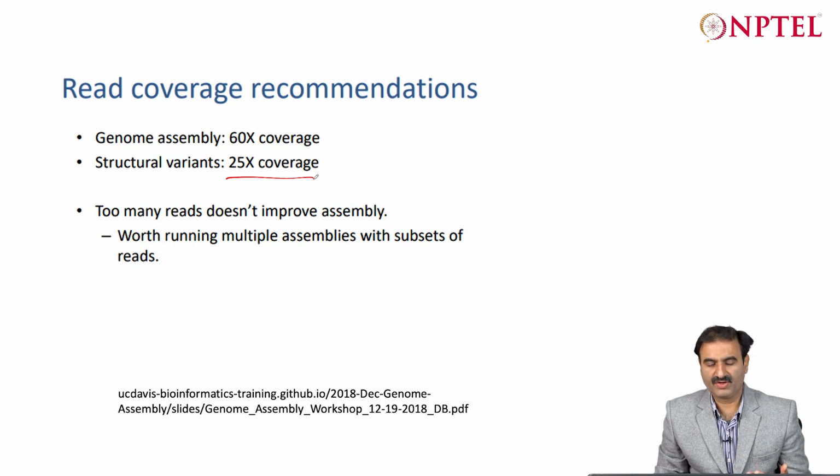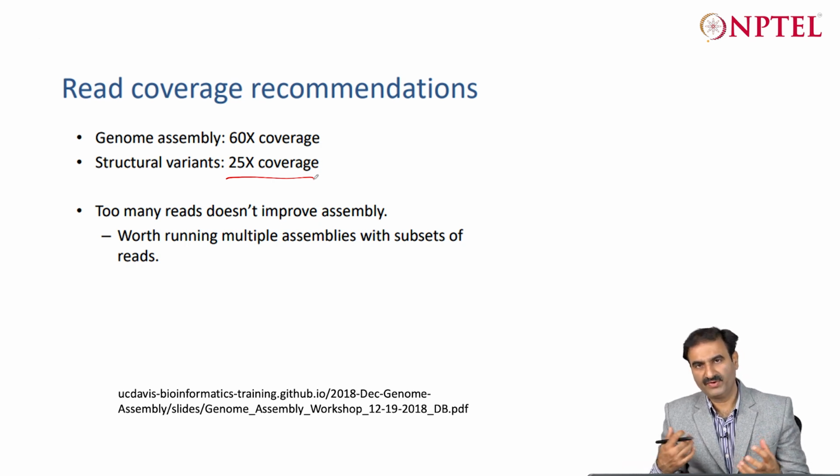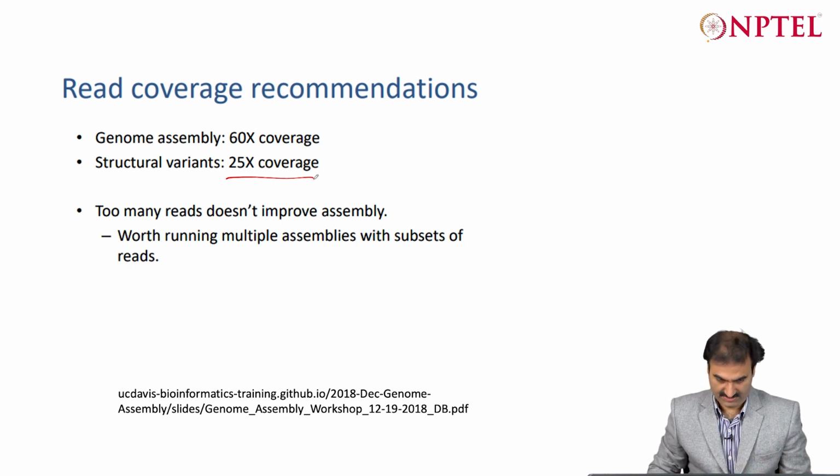It is not the case, because instead you can make multiple of these libraries, sequence them separately, and then once you have assembled them, you can merge the assemblies later, or you can do a hybrid assembly with nanopore or only short reads later.